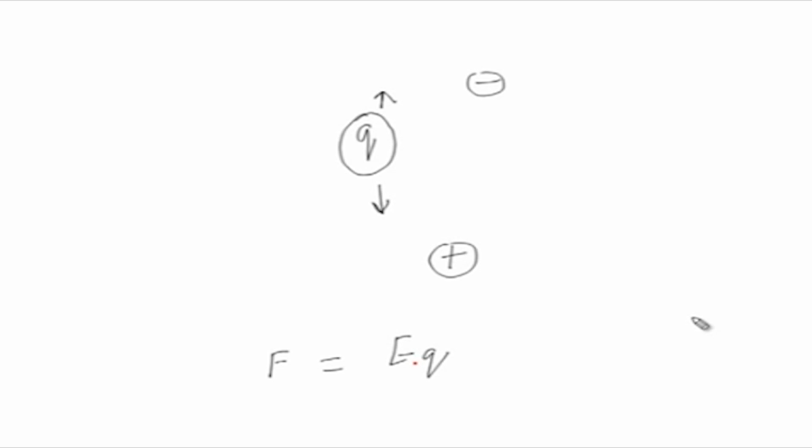Now, there is another force when a particle moves, like we were talking about size and shape here, that is frictional force. That frictional force will oppose the motion of the particle as it moves through a particular medium, and you can also call it a viscous drag, which is denoted as F.